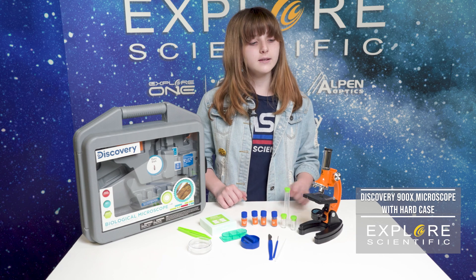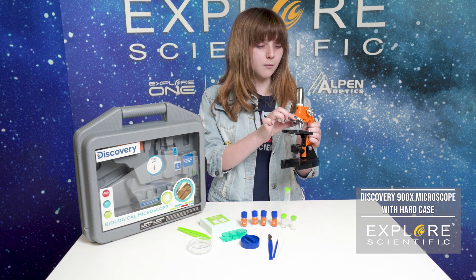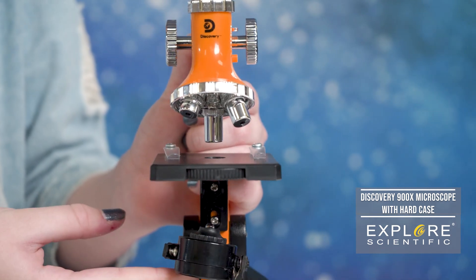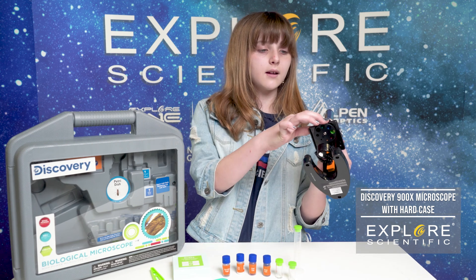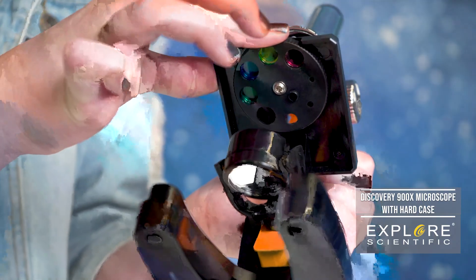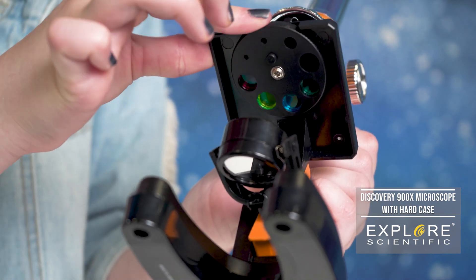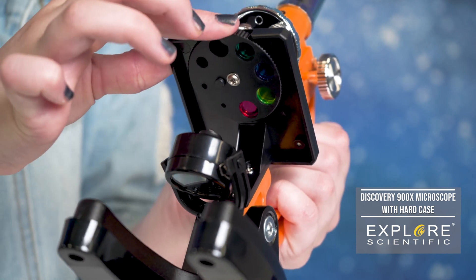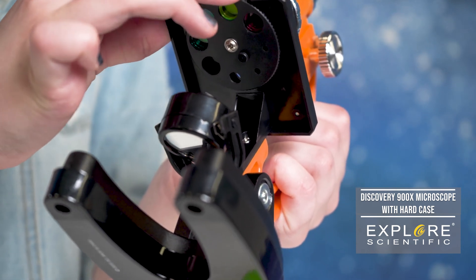With this microscope kit, you can see the microscopic world around you. The magnification ranges from 100 to 900 and there's an LED light located underneath so you can see. This microscope also has a color wheel located underneath. The different colors on it show different contrasts, so if you look at something through a different filter, it would look different than before — showing different things that you can't see with your own eyes.